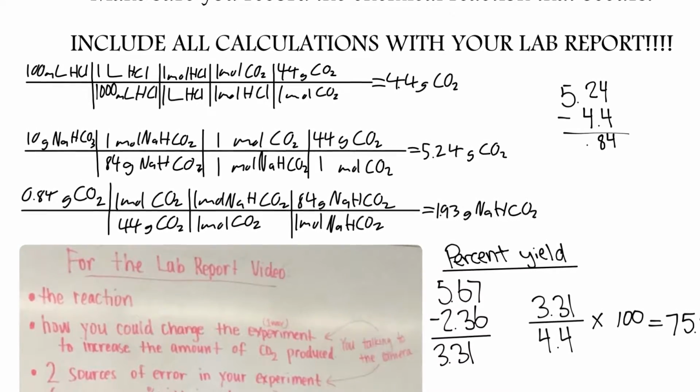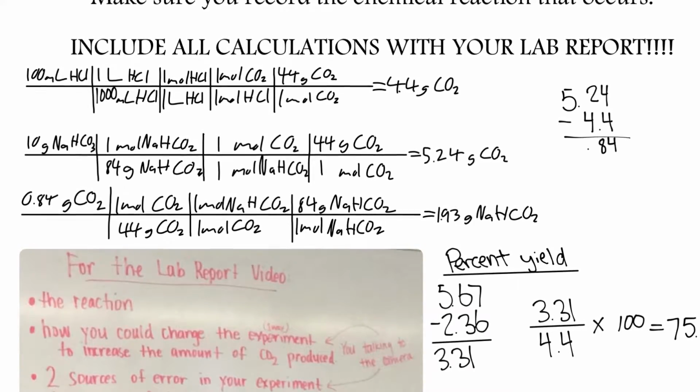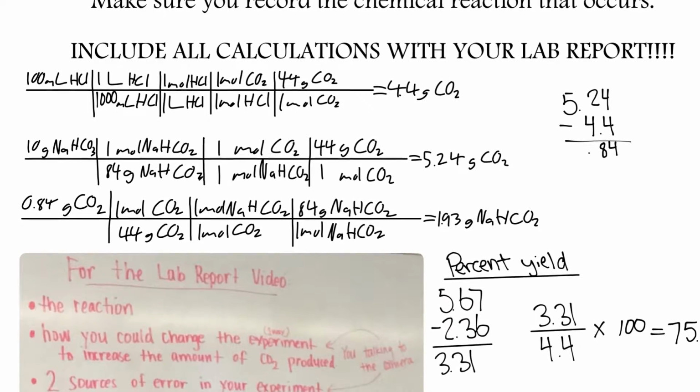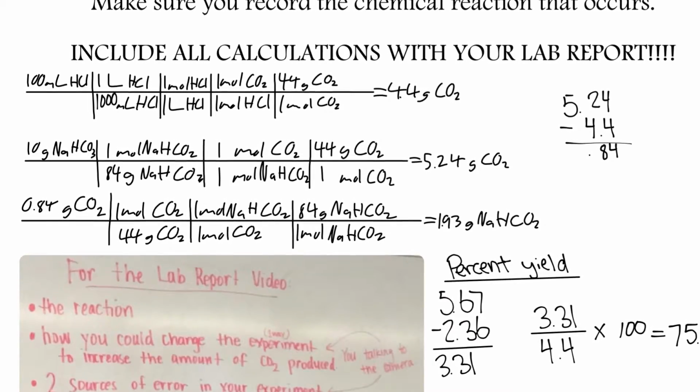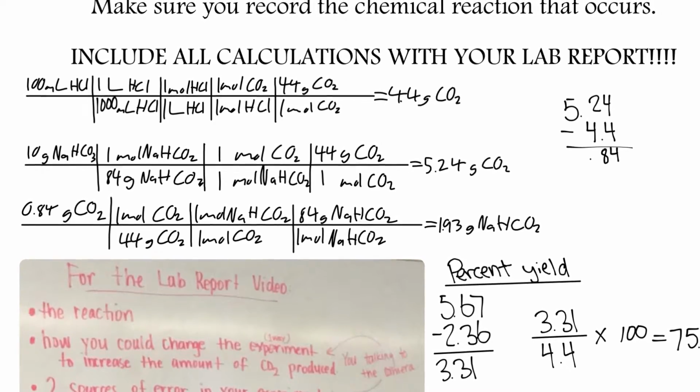Then we did the same for baking soda. While the baking soda was able to produce 5.24 grams of CO2, hydrochloric acid could only make 4.4 grams of CO2, meaning that the hydrochloric acid is the limiting reactant, and baking soda is the excess.